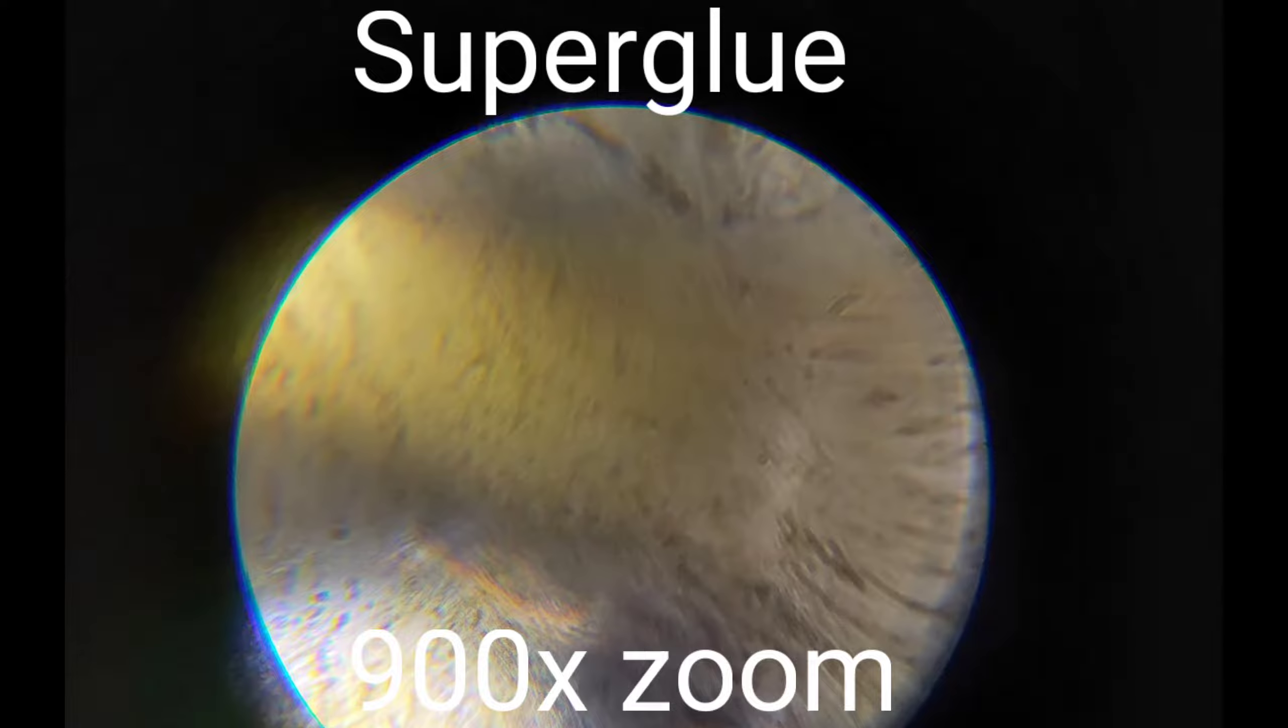So to start off, we have super glue at 900 times zoom. So what you see, the dots are actually bacteria in the glue. So if you're ever wondering what's in super glue at 900 times zoom, that is it.